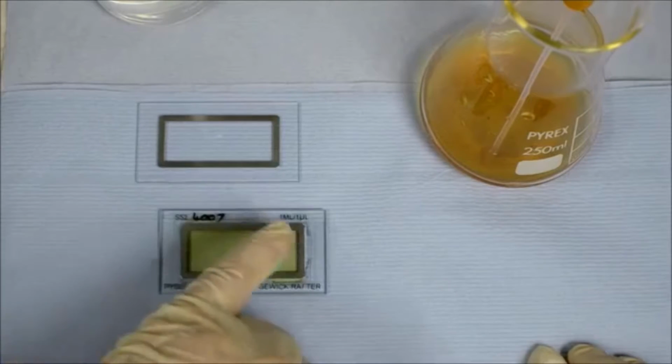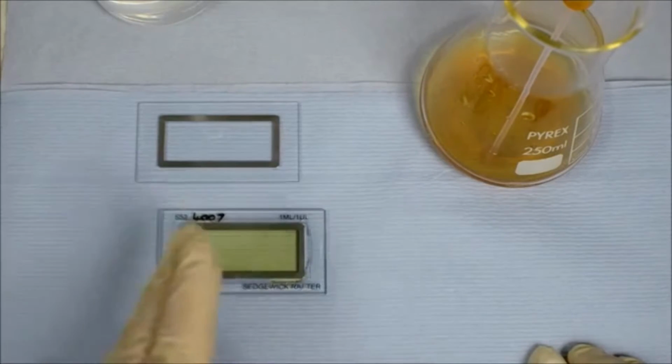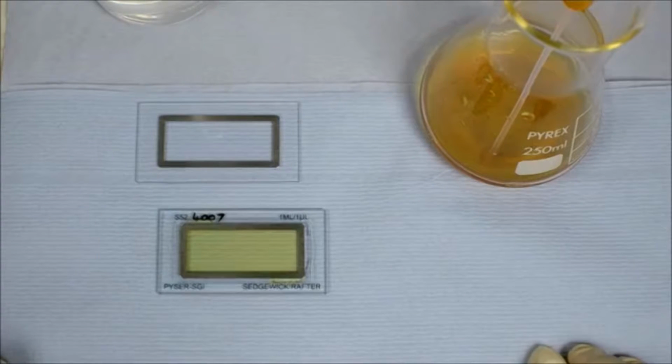There are 1,000 squares across this 1 milliliter chamber, so each one of the squares marks off a column with a volume of 1 microliter. Any number of squares can be randomly moved into the field of view, and a population count of a particular subject can be made for each of the microliter volumes. These counts are then averaged and multiplied up to estimate the density of a population in a sampled body or an area of water.